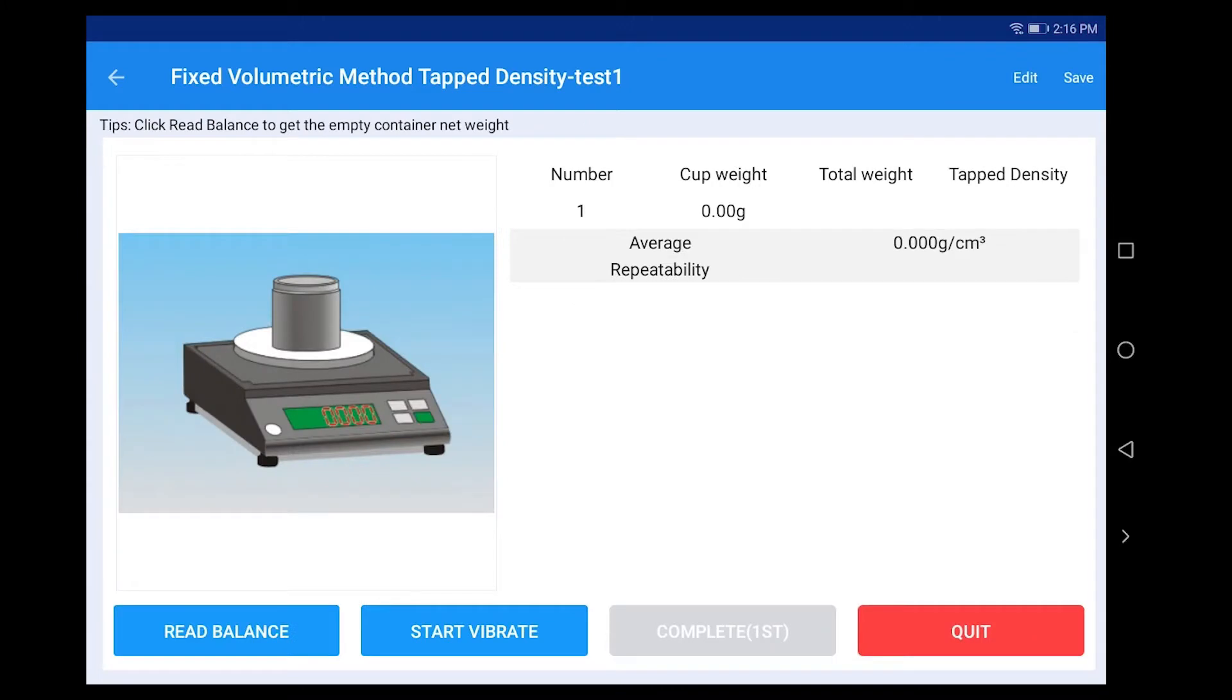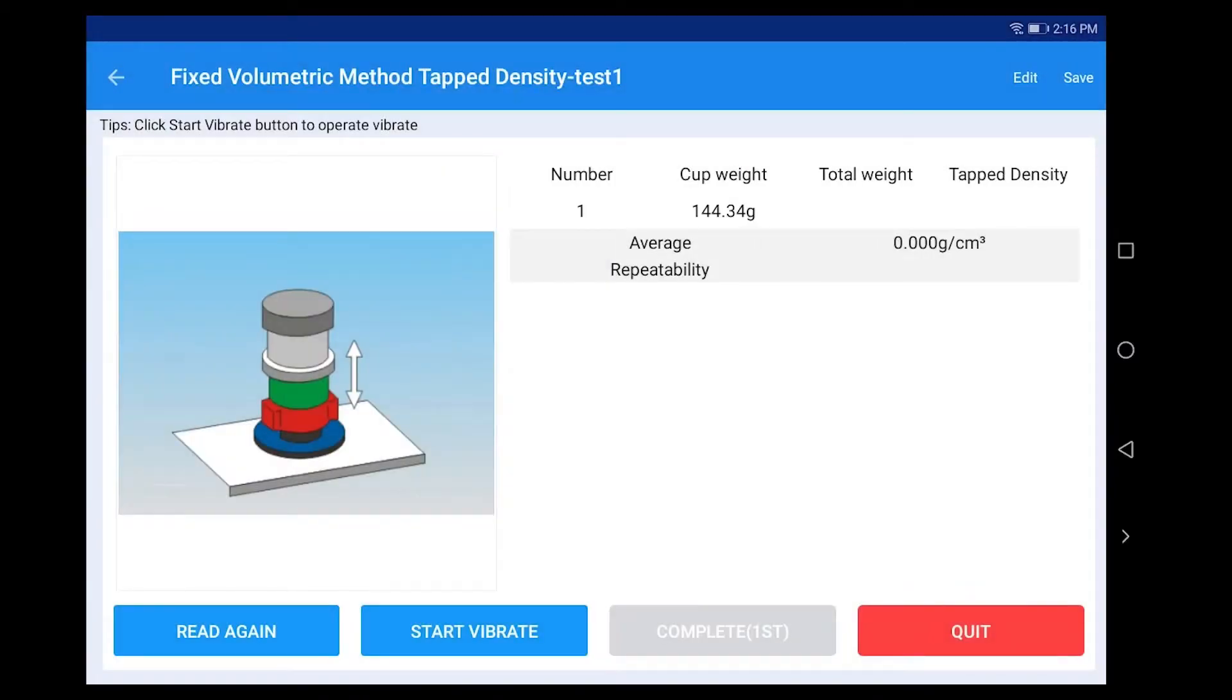Click Start Measure. Place the empty container on the balance. Click Read Balance to read the net weight of the empty container.